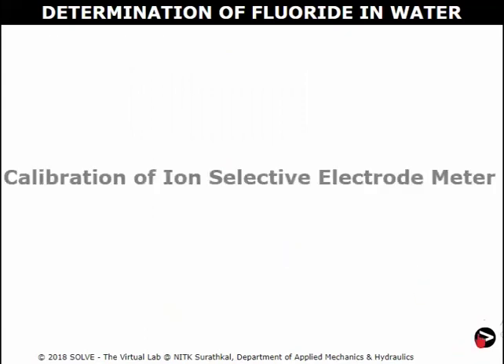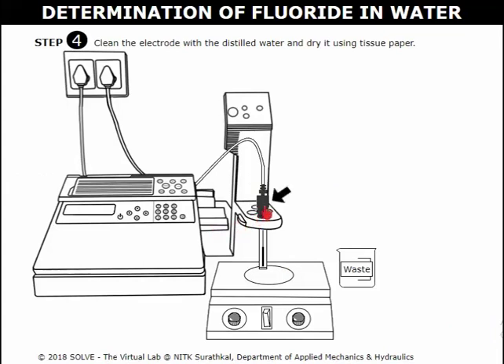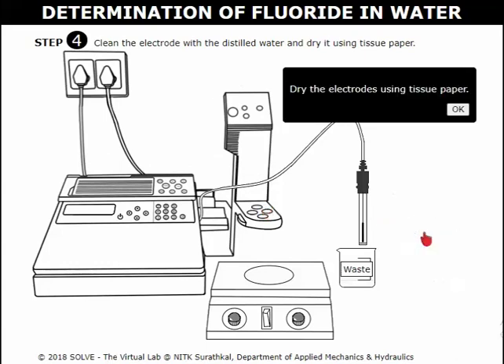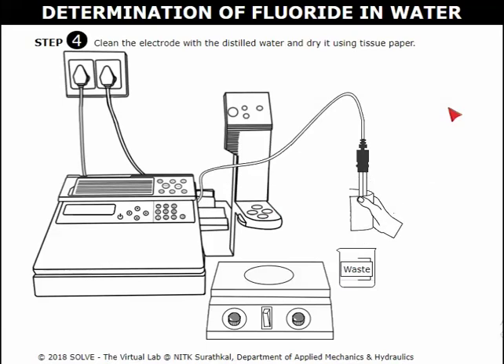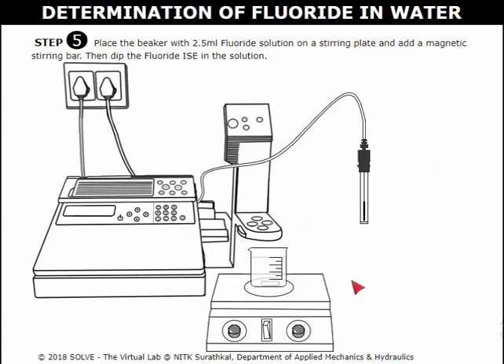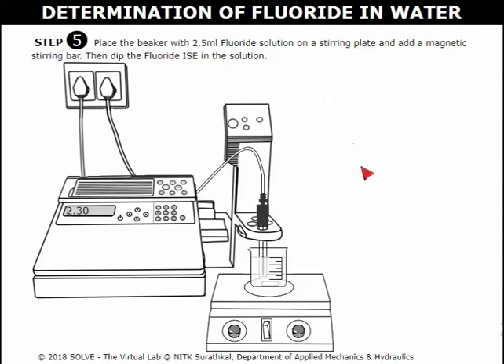Calibration of ion selective electrode method. Click here to place the electrode into the beaker. Click on the distilled water to clean the electrodes. Go through the instructions carefully. Dry it using tissue paper. Click on the beaker with 2.5 ml fluoride solution to place it on a stirring plate. Add a magnetic stirring bar and switch on the magnetic stirring machine. Then dip the fluoride ISE electrodes in the solution to determine the fluoride concentration. Switch on the magnet stirrer, then stop the stirrer after getting an accurate value.